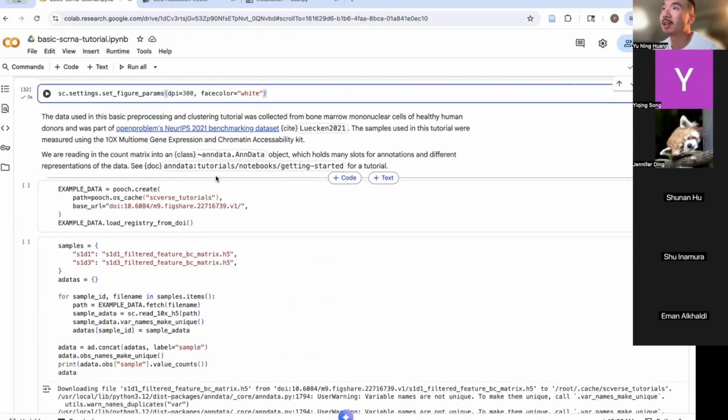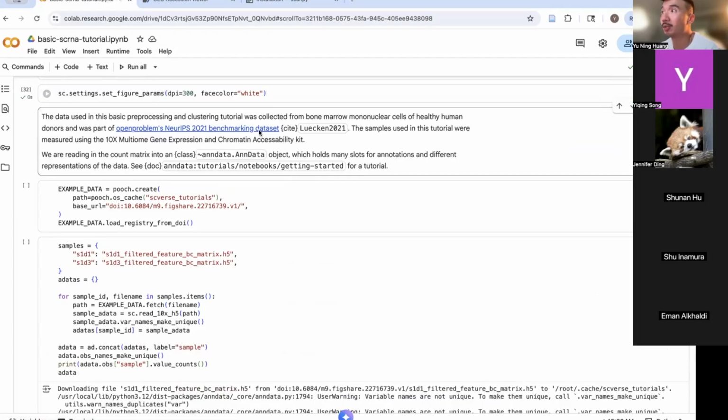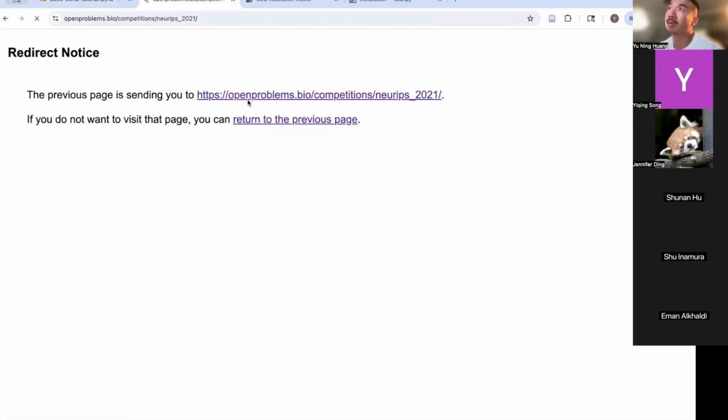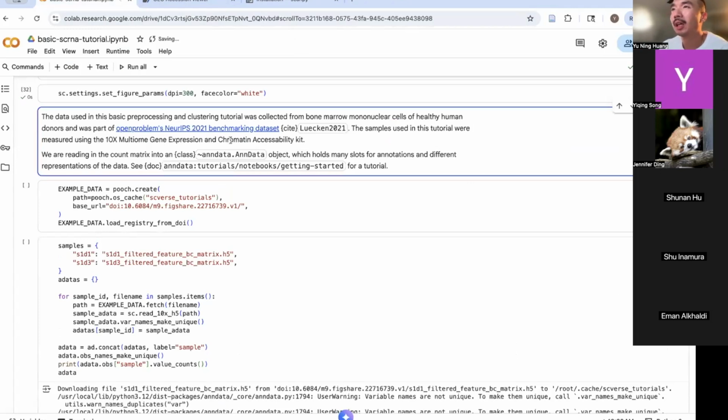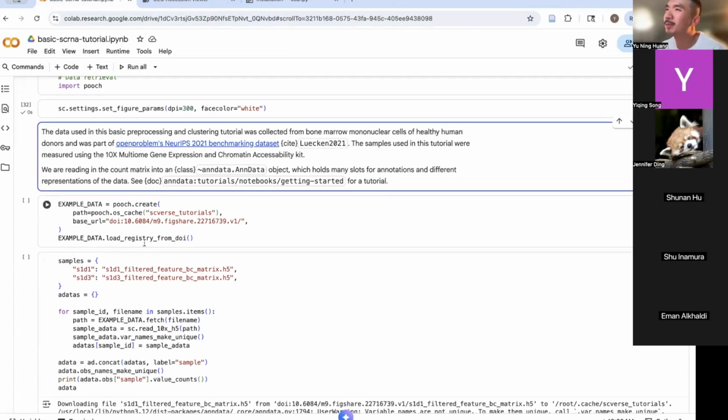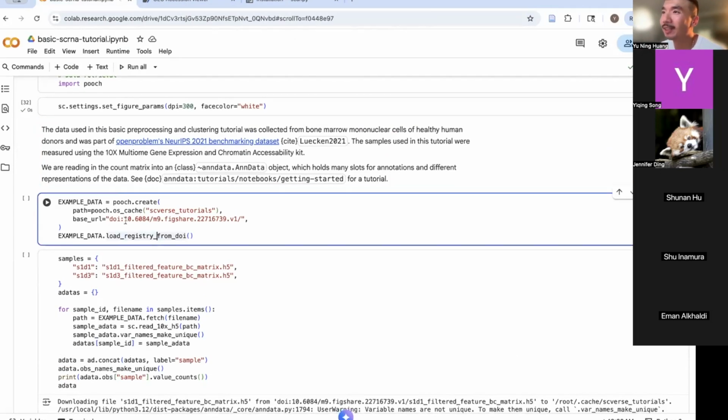This is just a quick reference for which study we are using. Wait, let's see if I can get the data sets out.